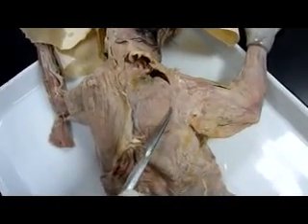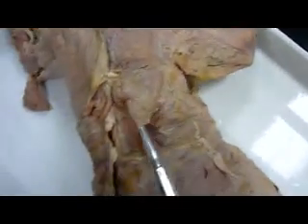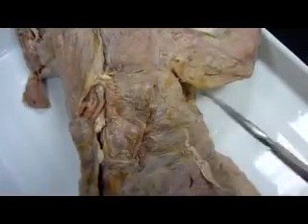This here is the acromiotrapezius. And this is our spinotrapezius.